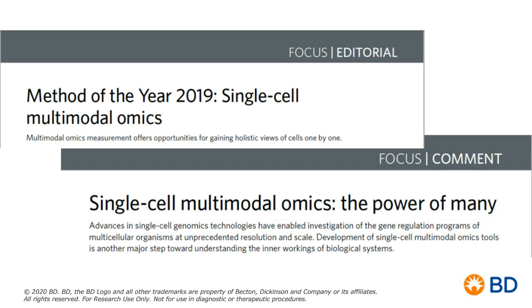Now, if you've used FlowJo before, you're probably familiar with the interface of how you look at cells and gate things, and there are various plugins that you can use to do UMAP or tSNE if you're doing high-dimensional protein analysis. Well, if you want to analyze your sequencing data, there's something called SeqGeq, S-E-Q-G-E-Q, and that is part of FlowJo.